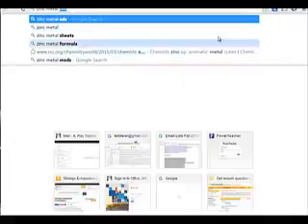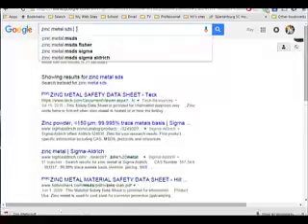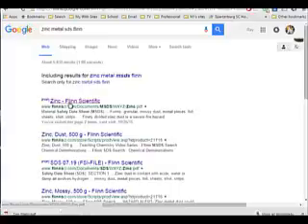And you can choose to look for it almost anywhere you want to. We can just plug it in like that and search for that, and we'll find lots of websites where they have zinc metal safety data sheets. But I always find that Flinn Scientific, which is the company from which we get most of our chemicals for our labs, seems to have a really super simplified, high school kind of safety data sheet. So I kind of like those. The way that Flinn is spelled is F-L-I-N-N. I'm going to put that in and go find it. And there's a Flinn Scientific MSDS, and you can see it says MSDS right here at the top, the name of it for Flinn Scientific. Just click on that, and there's your zinc metal MSDS.